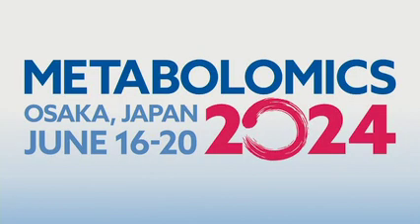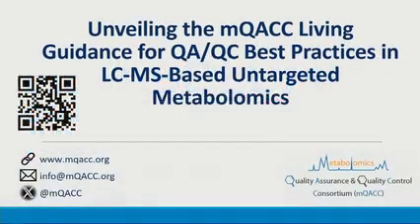Today we're going to start talking about our living guidance, and let me start sharing the slides. There you go. Okay, so thank you for coming to our workshop. The title of our workshop is Unveiling the mQACC Living Guidance for QA/QC Best Practices in LC-MS-based Untargeted Metabolomics.